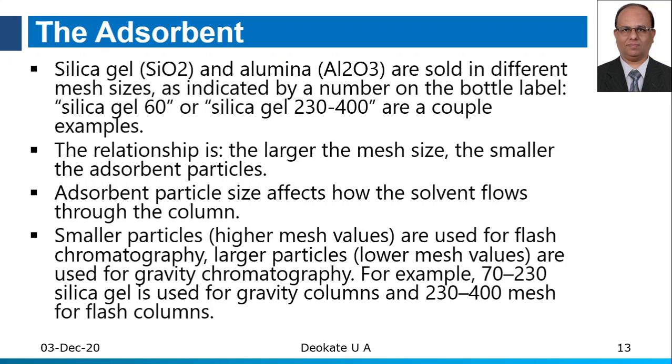The simple column chromatography used in the laboratory is modified to the flash chromatographic technique, where two modifications are used. One is the movement of the mobile phase by pressure, that is using pumps or vacuum, and the other is the detection technique. Here we can use a UV visible spectrophotometer for the process of detection.